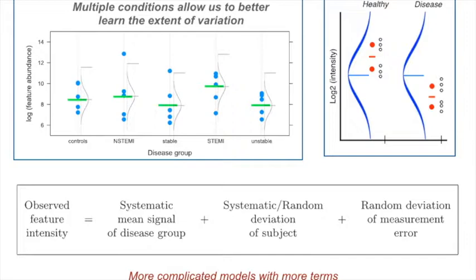So these models are very general, so we can also work here as an example where we have biological and technical replicates. We can also extend the same type of models to cases with biological and technical variants. So these are very general models that are called linear mixed models, which can reflect very complex combinations of conditions and so on. It would require a lot more time to go over that, but I just wanted to highlight the fact that we use this more general family of linear mixed effects models to reflect these data structures.